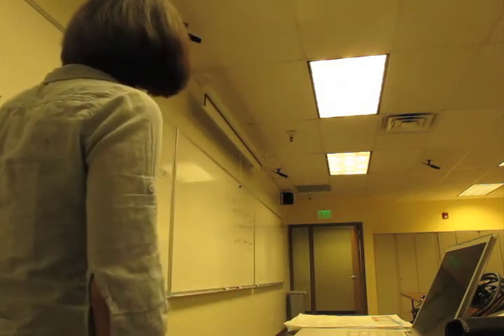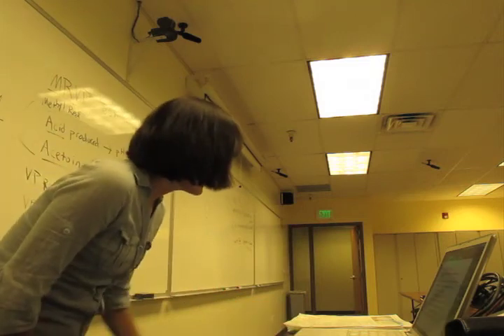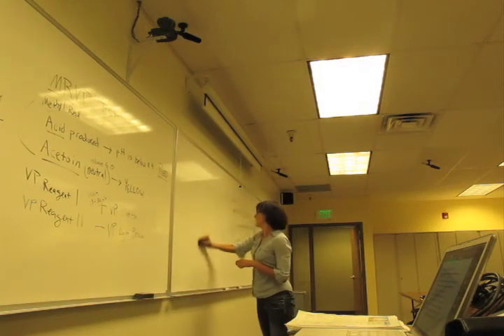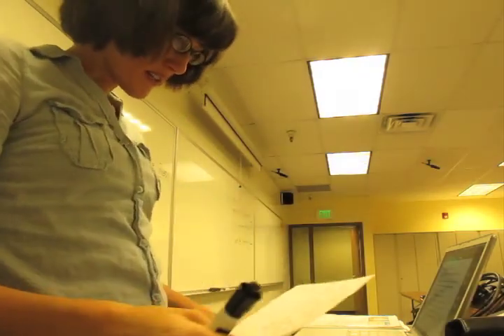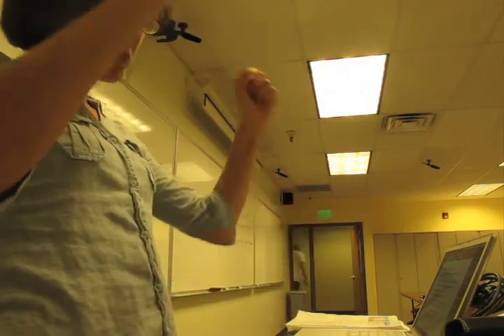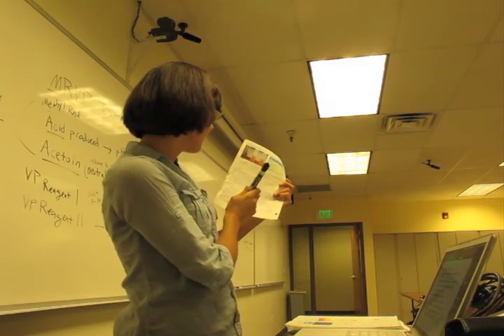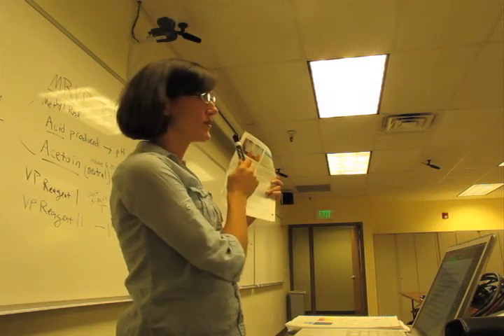Okay, so I hope that helps. You're going to look at it in lab today, and it'll probably be easier when you actually have your hands on and are doing the tests. The last test in exercise 14, which is pretty straightforward, is the citrate test. What you're looking for in this one is whether the bacteria has the enzyme citrate lyase to break down citrate to form pyruvate. Definitely read through and make sure you understand, because he might ask you, in the citrate test, bacteria with enzyme citrate lyase breaks down citrate to form blank. You might have to write in pyruvate.